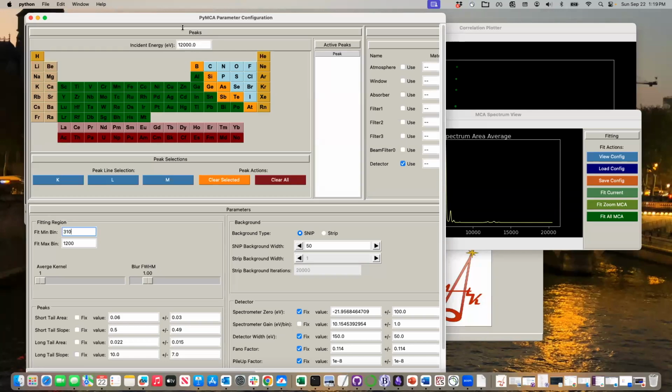Bump it up. So we're going to start with potassium, and then we just say K edge, please. Calcium, K edge, titanium, K, chrome, K, our best friend manganese, second best friend iron. We might see if there's any cobalt in this one. Normally we always ignore cobalt because it's right on the beta of iron, but we'll try to see if we can pick anything out. We're doing the PyMCA version, and we'll go up to zinc. We don't want to stress it out too much, right? And there we go. So there's our peaks.